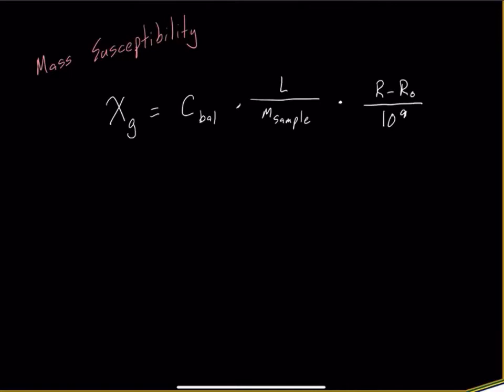So the first component is just a calibration. This is something that is used to make sure that the machine has accurate readings. This is something that you wouldn't normally be doing in the lab. This is something that I would do ahead of time. And after a handful of calculations and measurements here, this number comes out to be equal to 1 about 99% of the time, right?